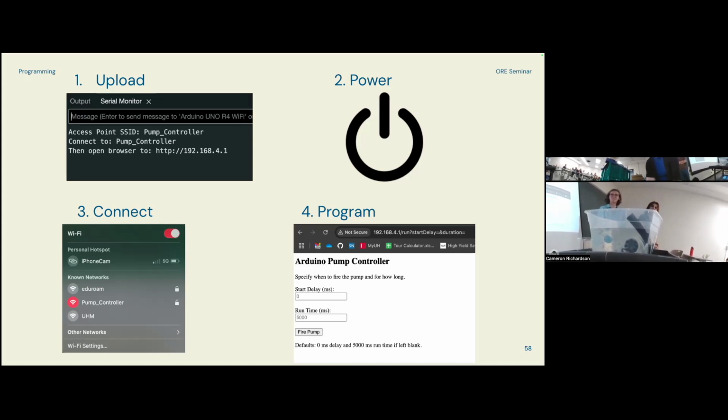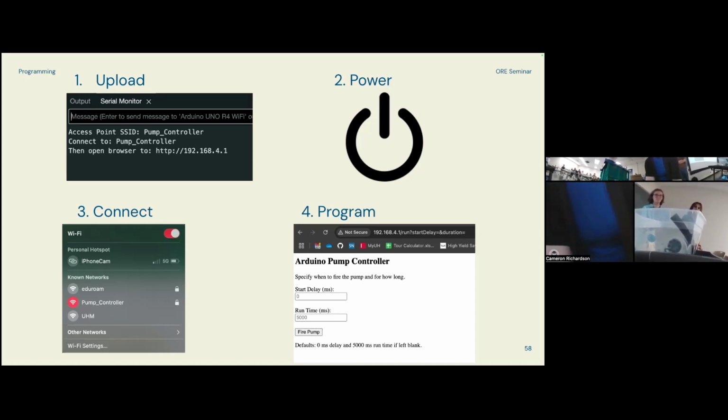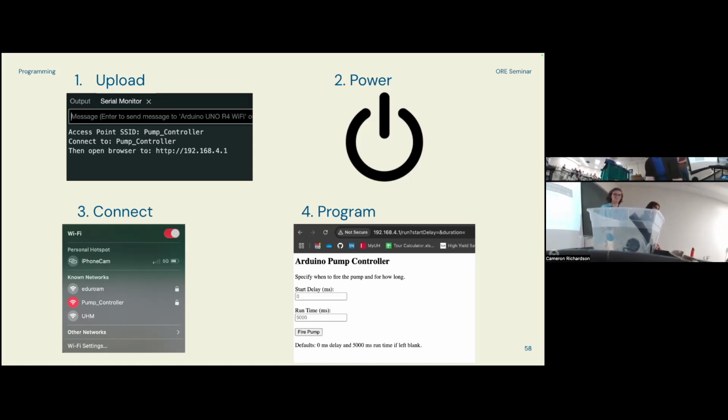How many samples did we say you can collect before the battery dies? 66, if it's at full charge, which currently isn't because we've been testing it for the last couple of months. So maybe 66.